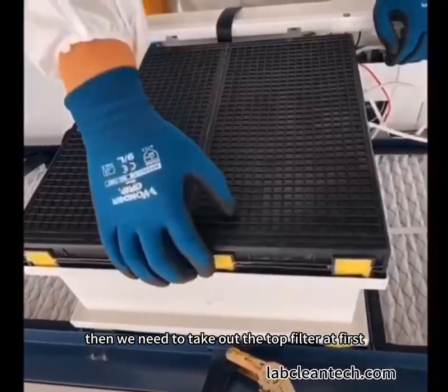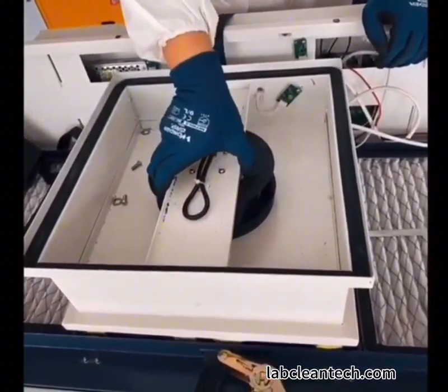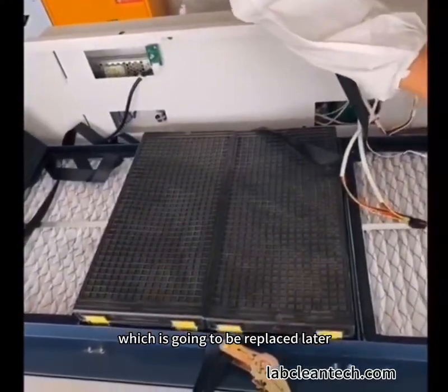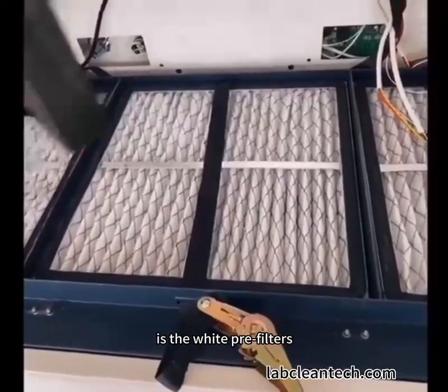Then we need to take out the top filter at first. Next is the white PSE fans. And also the black middle layer filters, which is going to be replaced later. And now at the very bottom, as we can see, is the white pre-filters.